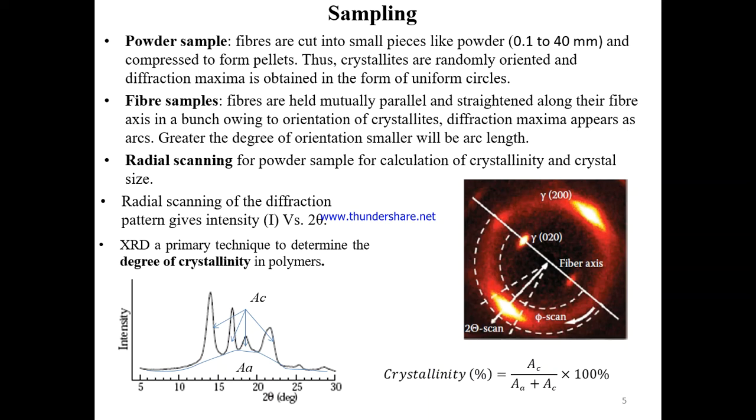Now one can segregate the peak area from the diffuse area, as I am showing here by this blue line. The total peak area is measured by software.